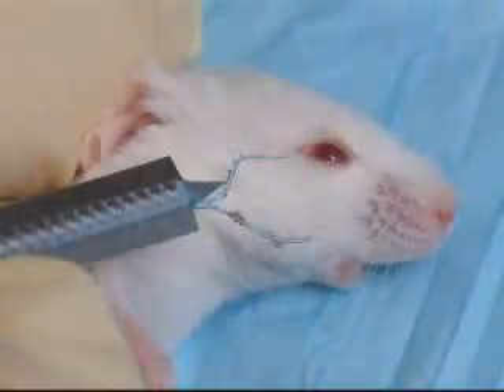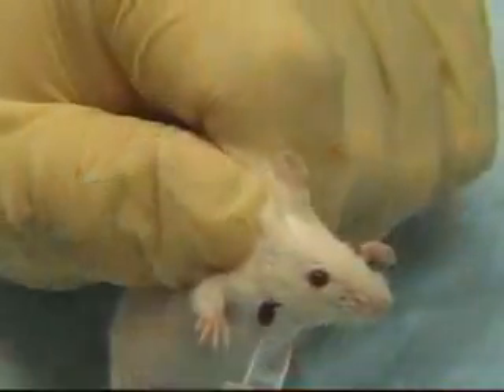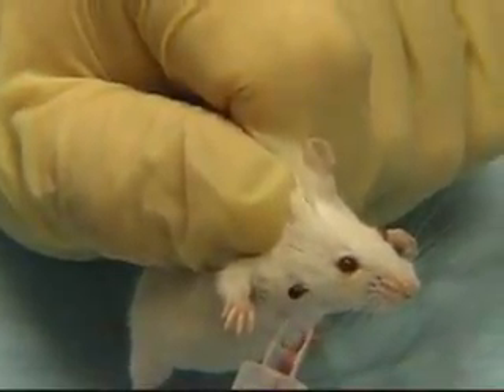These veins offer a much larger target area than with retroorbital bleeding and are much larger in diameter, offering a faster flow of good quality blood. Blood flow will start instantly, so have the collection tube nearby.